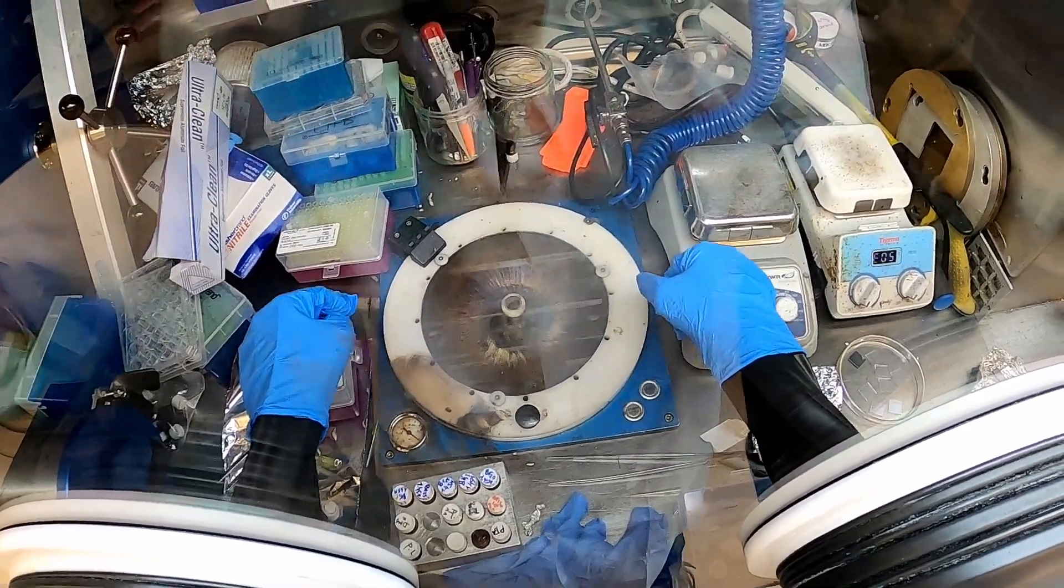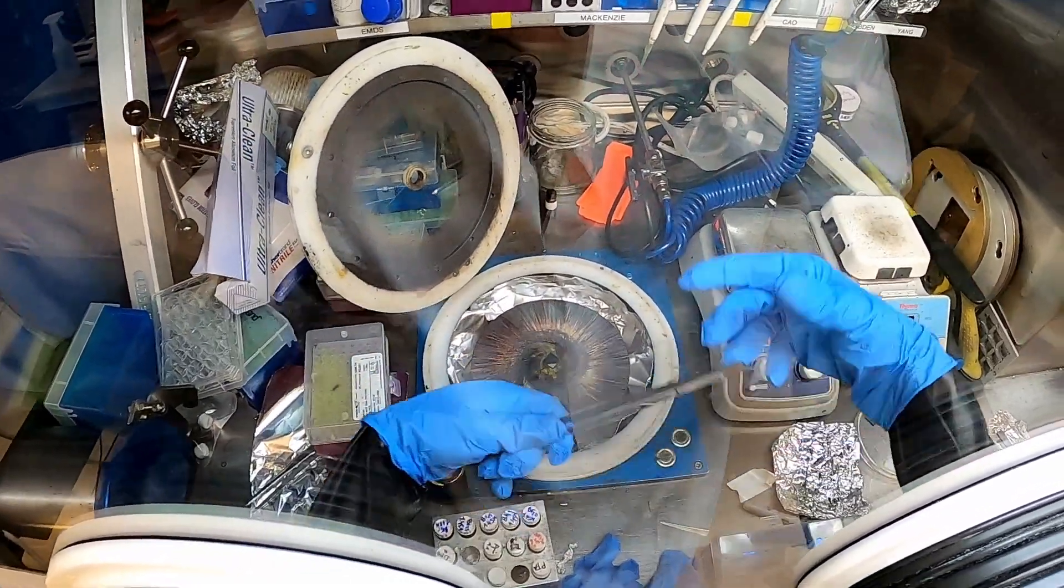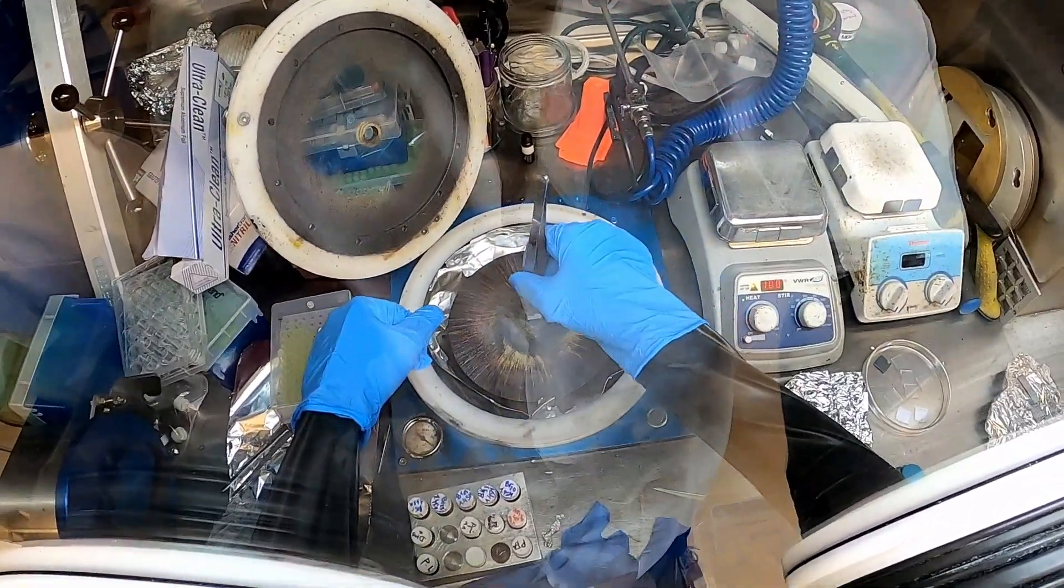Once the spin coater stops, the sample will be transferred to a hot plate and annealed to drive off the remaining solvent. You can see the film has changed color.